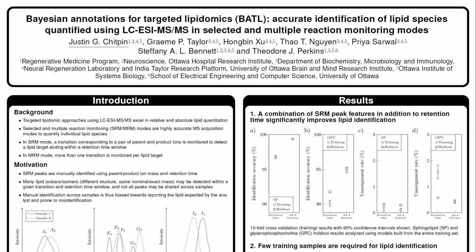My name is Justin G. Chitpin. I'm from the University of Ottawa, and my poster is titled Bayesian Annotations for Targeted Lipidomics, or BATL: Accurate Identification of Lipid Species Quantified Using Liquid Chromatography coupled to tandem mass spectrometry via electrospray ionization in selected and multiple reaction monitoring modes.